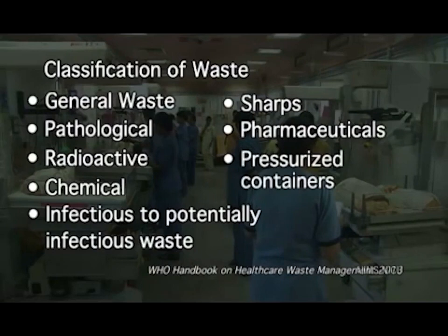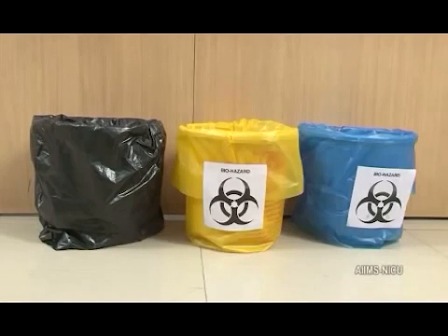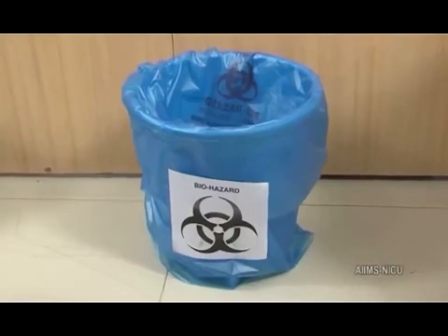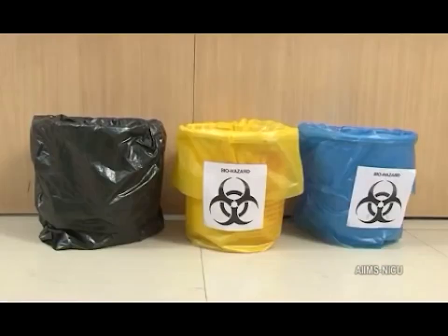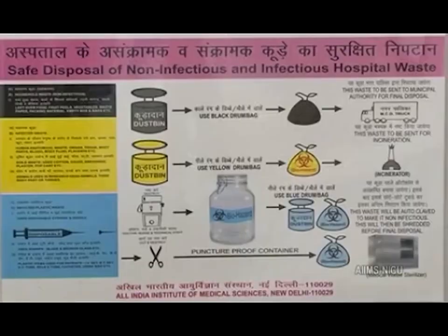All health professionals should be well conversant with their local hospital policies for waste disposal, which may vary from one place to the other. Commonly, there is a color coding for disposal of biomedical wastes. Drums with black, blue, and yellow polythene bags are used to segregate different types of wastes, each one of which has to be disposed of in a different way. Some hospitals use 4-colored bags for waste disposal. We have to refer to individual hospital policy regarding the waste disposal in these scenarios.